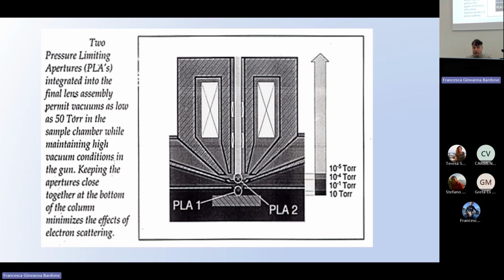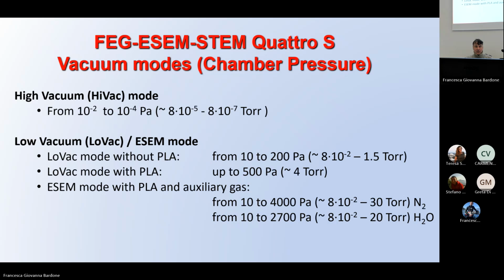This is the way in which you have your material, which can contain water. And look at this magnification. All these are different specific chambers with different vacuum levels, a few millimeters in size. So the gradient is very, very small in the final part.